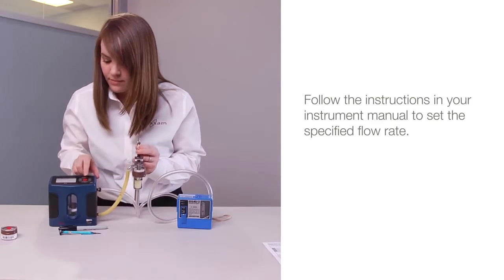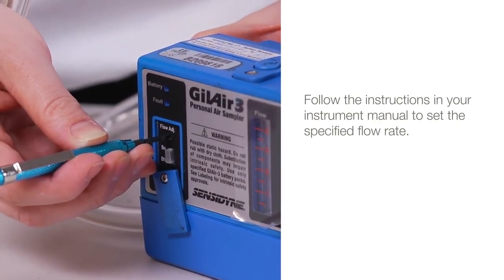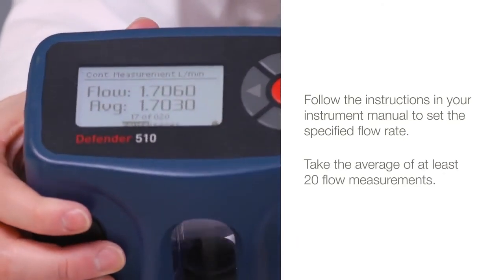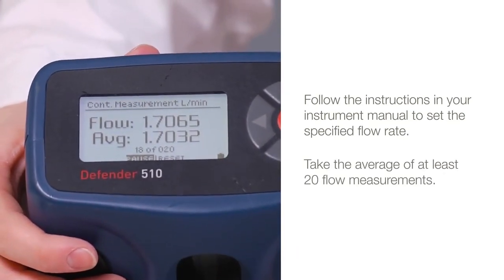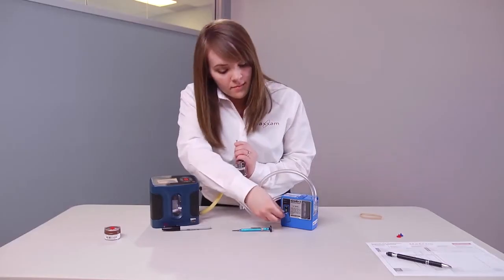Follow the instructions in your instrument manual to set the pump to the specified flow rate. Take the average of at least 20 flow measurements to account for flow variations due to direct connection of the pump to the calibrator. Then turn off the pump.